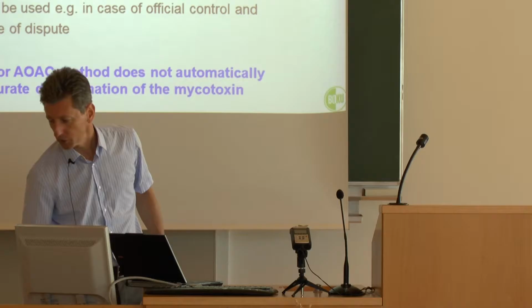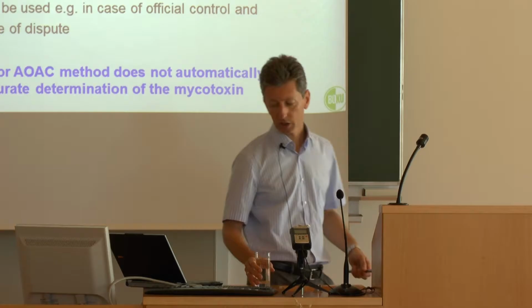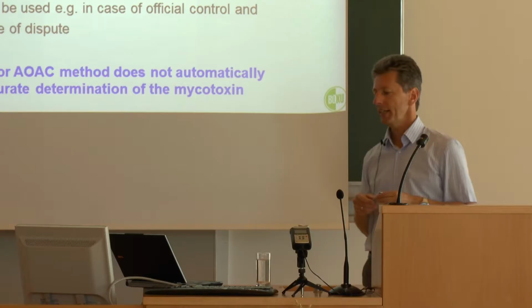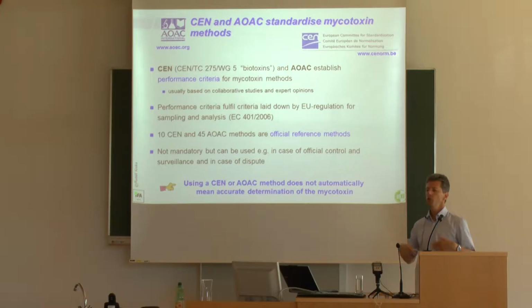The greater number is based on the history of AOAC, an institution established a couple of decades ago. Among these 45 AOAC methods, there are many which are only based on thin layer chromatography, so you don't expect too sophisticated methods there. I also have to point out that these official methods are not mandatory. So if you are an official control lab, you don't necessarily have to establish these official methods.